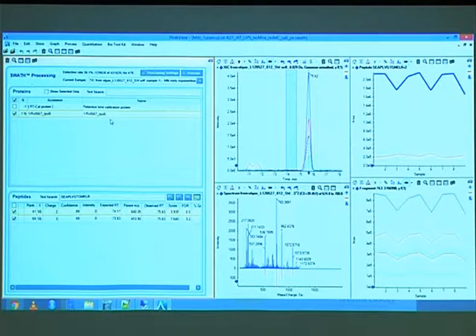I don't know how familiar you are with bacteria, but this is an RNA polymerase. So this is a protein that is just there. So if you don't find that, something is fishy. This is another good control. Usually, if you get the sample from someone, they know what kind of protein should be in there.